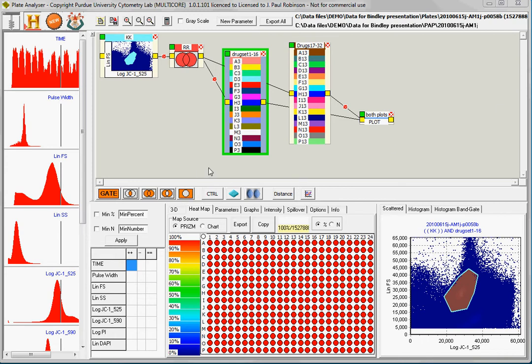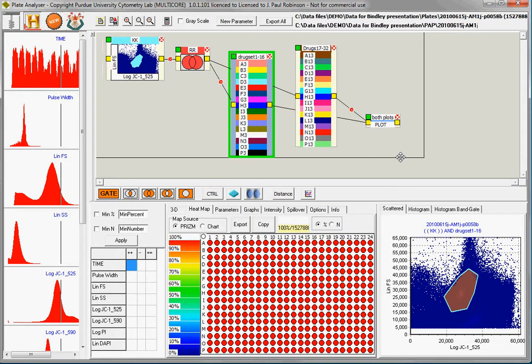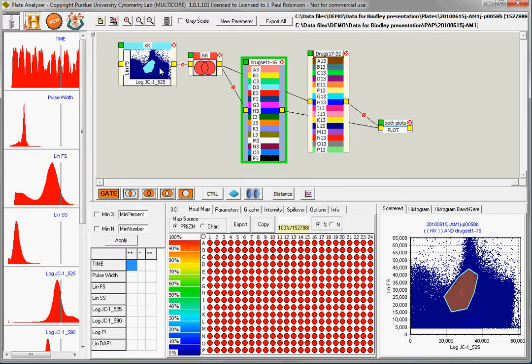Okay, I'll try and show you a few of the other features. Some simple things like putting a box around all of these and grabbing the edge of the box. You can move all of your PAP file members, or you can move them individually. I'm going to delete some of these. Let's delete this one.